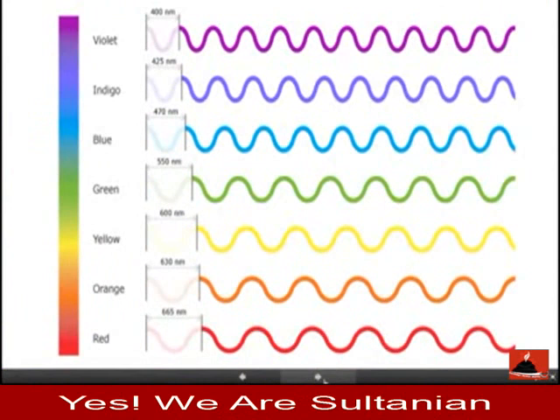So, why is it that an electron microscope can achieve a high resolution? Well, basically, it's got to do with the wavelength of light and electrons. So the wavelength of light is usually between 400 nanometers and 670 nanometers. The 400 being the violet end of the spectrum, and the 670 sort of being the red end of that spectrum.